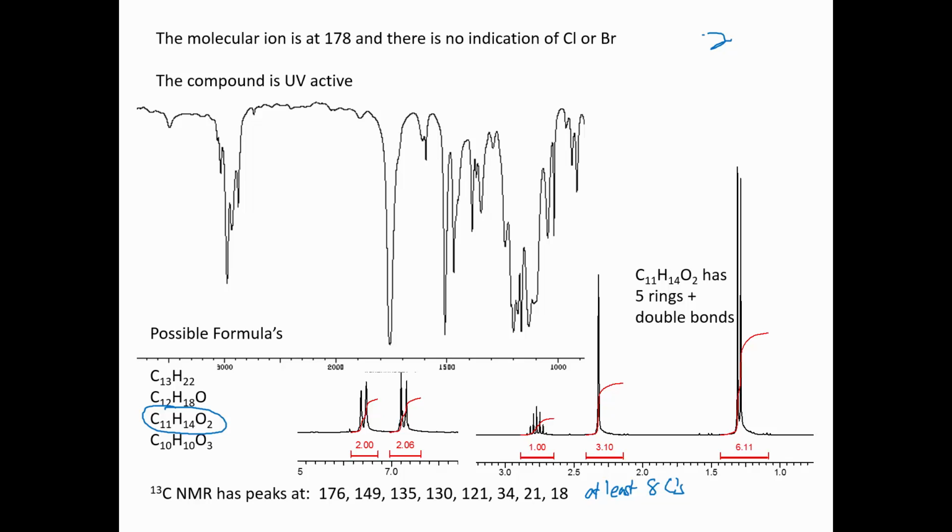Remember, when we have a really high unsaturation count, what we typically consider is that it's very likely that we have an aromatic ring. This is because an aromatic ring gives us a lot of unsaturation in a small area. Benzene itself has 4 degrees of unsaturation, a ring and 3 alkene groups.